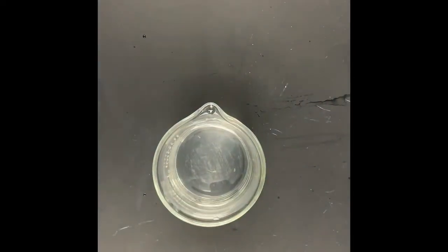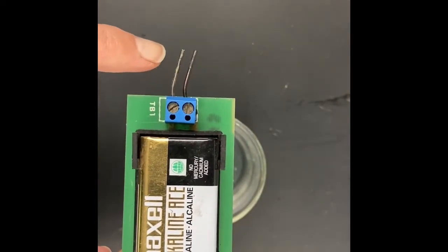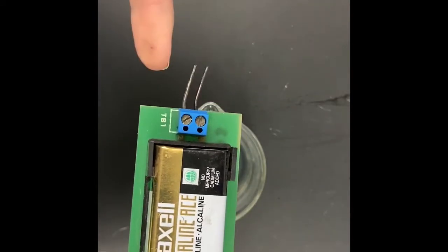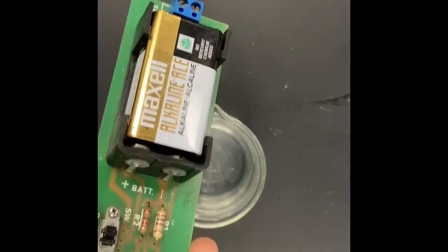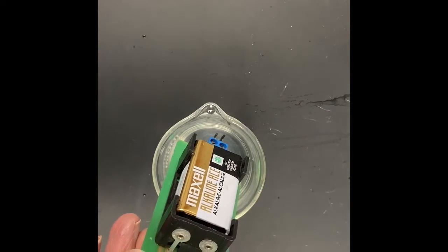Okay, you guys, I'm going to put in the conductivity tester. You'll notice we've got the 2 electrodes here, and the lights will go on if there indeed is a current, if there are moving charges passing between the electrodes, which will show that this is a conductor.